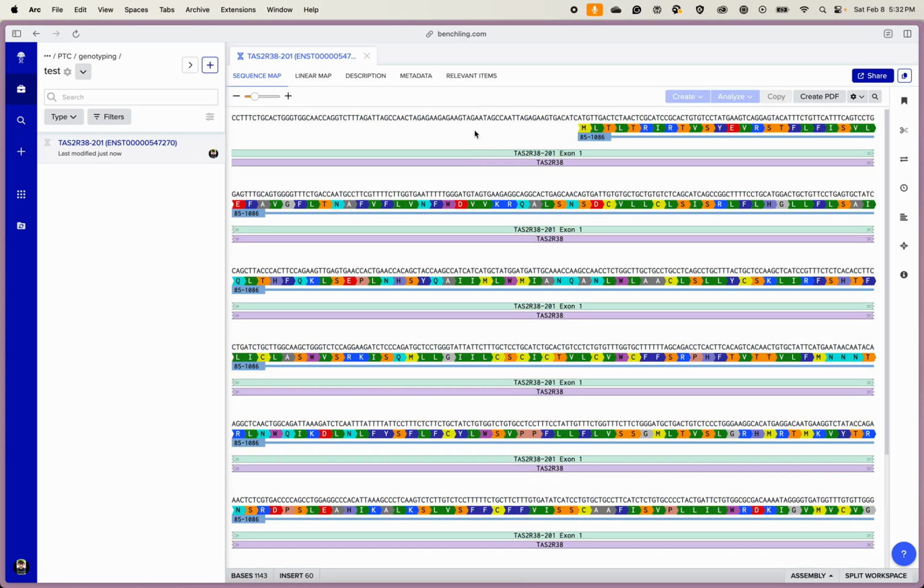So it's pretty cool. So question 1 on the pre-class homework last time, the last one, right, was what was your expected base pairs for the PCR product, right? So I saw a lot of people struggling with that question, and probably we're a little bit turned around on how to go about solving it. We're gonna do it in Benchling.